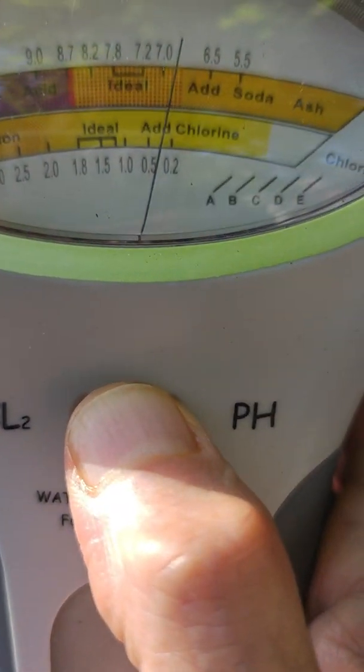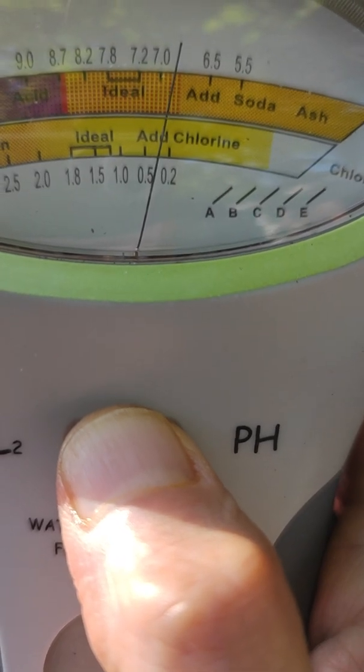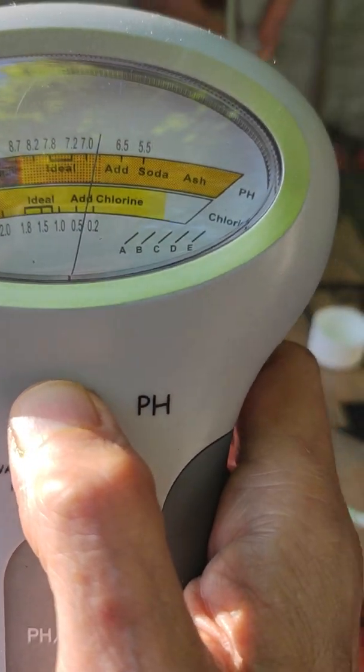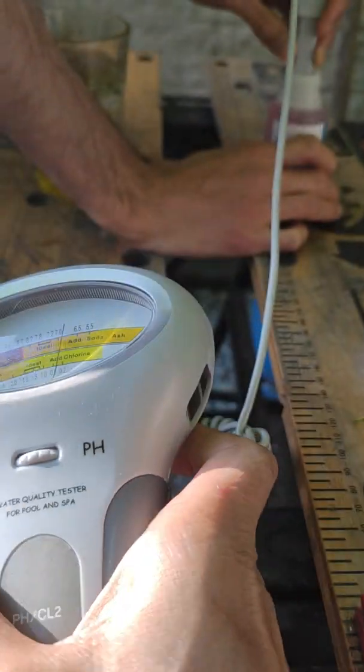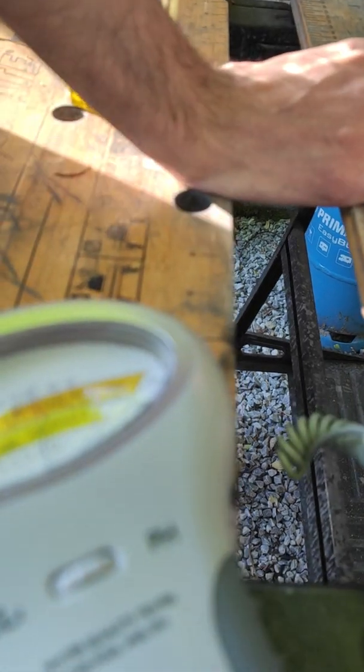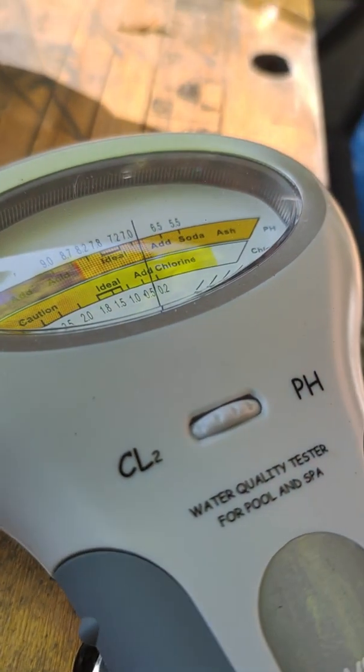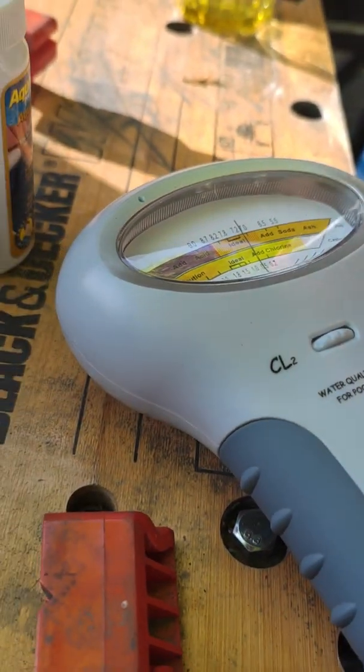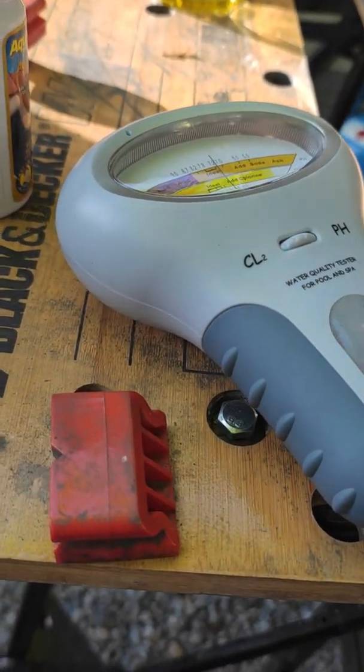It is showing close to seven, whereas that is calibration fluid for four. So neither the chlorine or the pH are working.